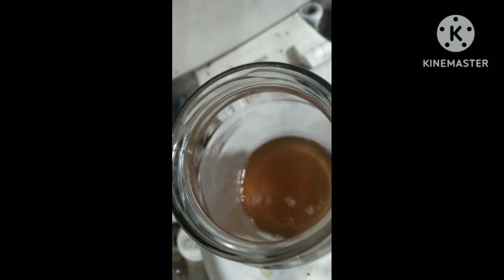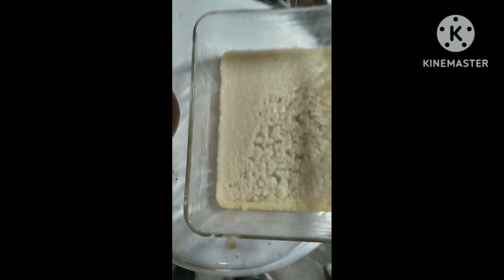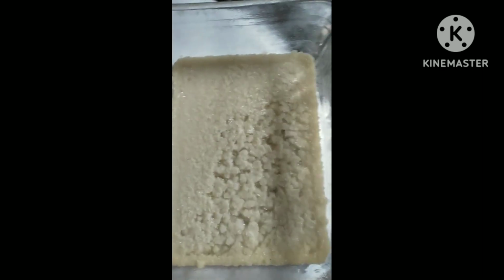Here it is out of the solution. There's the solution, still pretty cold. Now I'm going to put it into this filter flask, and vacuum filter or vacuum air through it to try to dry it up, and then I'm going to put some acetone on it.